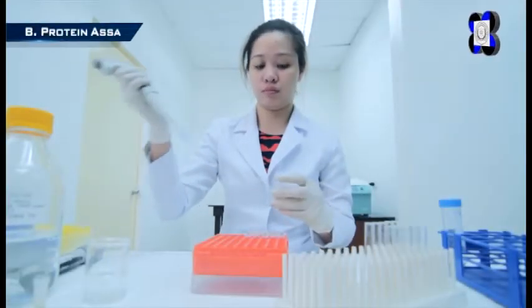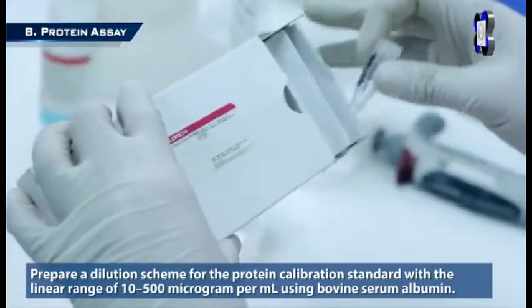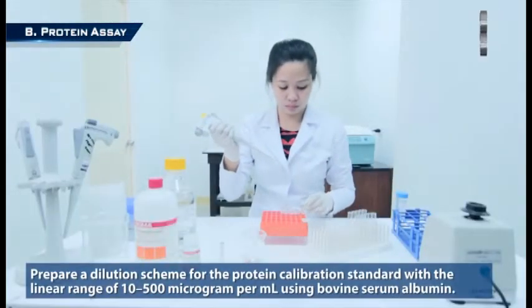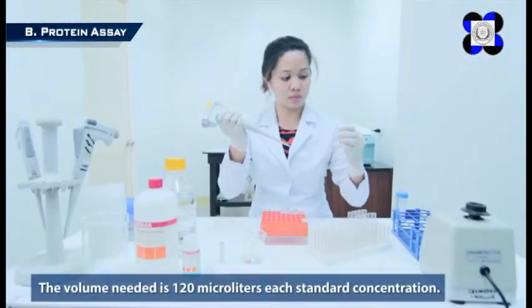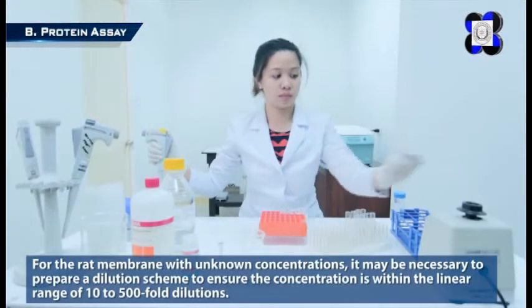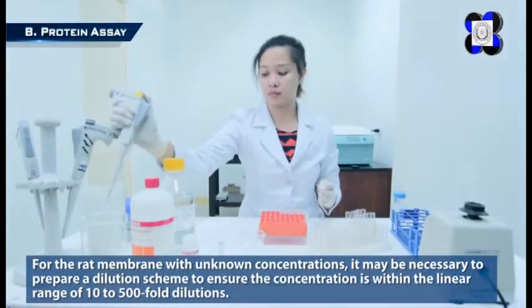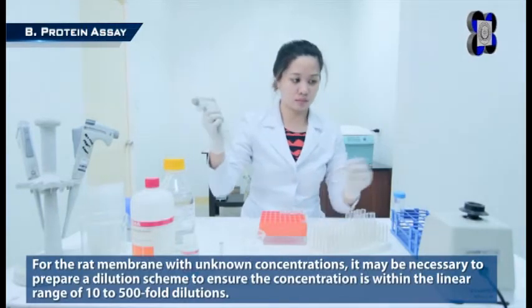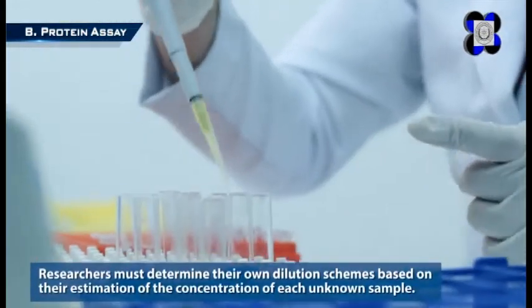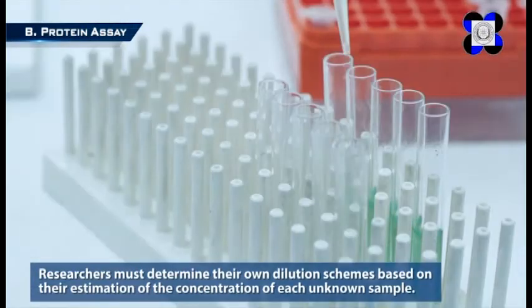The protein assay follows the procedure in triplicates that will be shown. Step 1: Prepare a dilution scheme for the protein calibration standard with a linear range of 10 to 500 micrograms per milliliter using bovine serum albumin. The volume needed is 120 microliters for each standard concentration. For the rat membrane with unknown concentrations, it may be necessary to prepare a dilution scheme to ensure the concentration is within the linear range. Researchers must determine their own dilution schemes based on their estimation of the concentration of each unknown sample. The volume needed is 120 microliters per unknown sample.